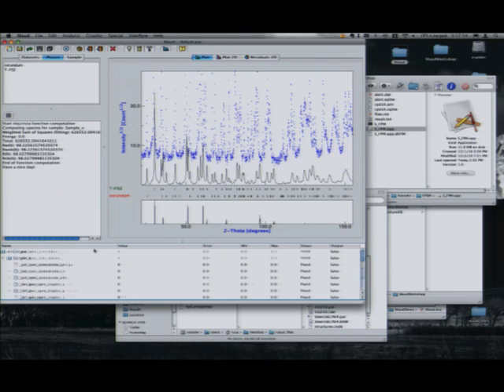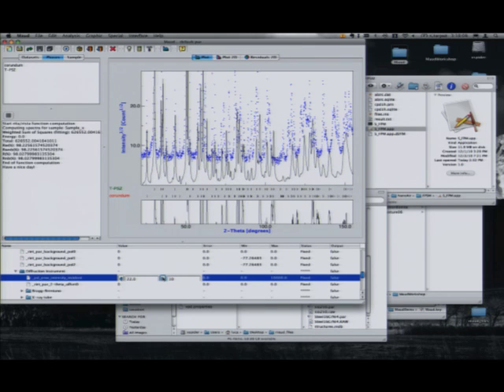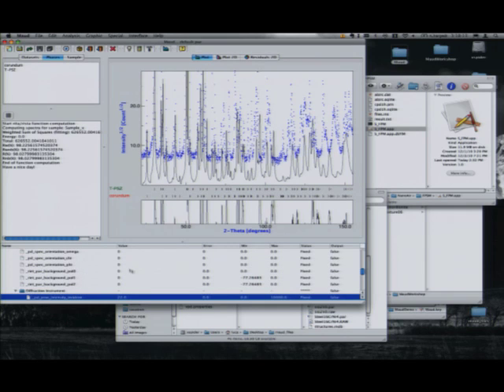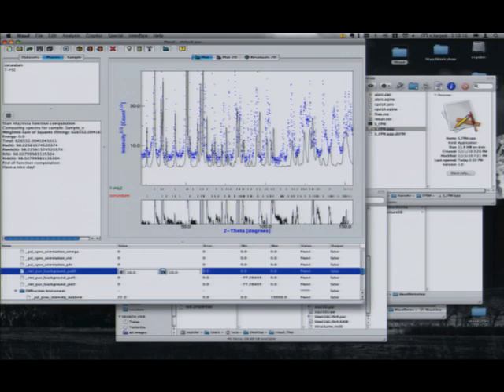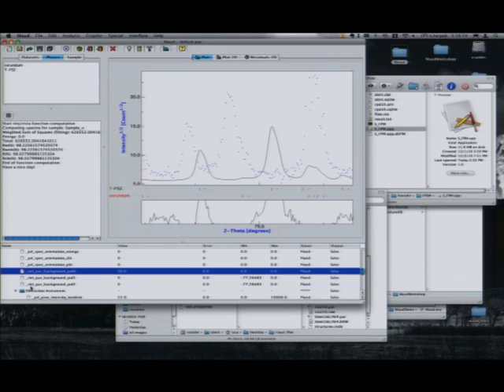So first, I want a little bit more intensity just to see if I am correct. So I just go here. On the instrument, I have the overall intensity. So let's say a step of 10, and then you change your intensity. And you can do it for the background. Let's say I go higher with the background, just to see. Now I should see better what I have. And then I go over here, to my set parameter.